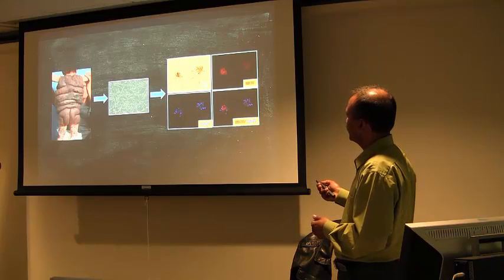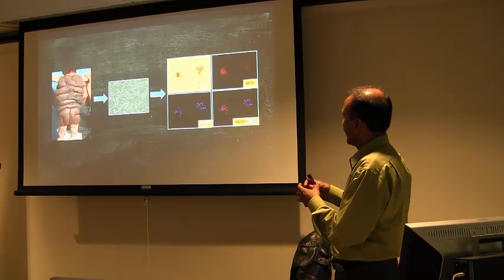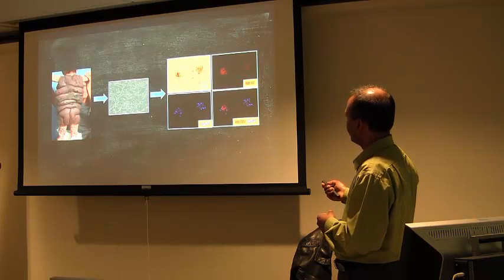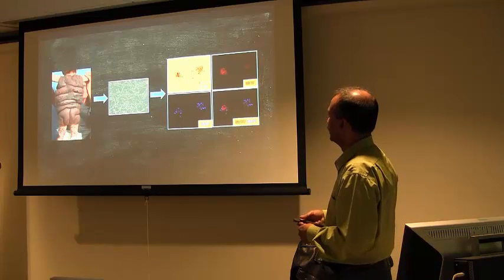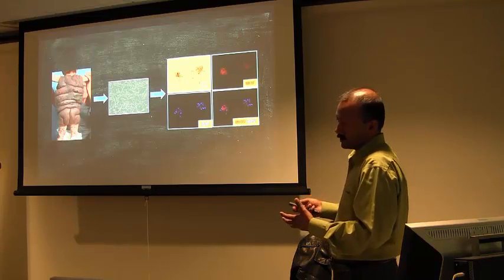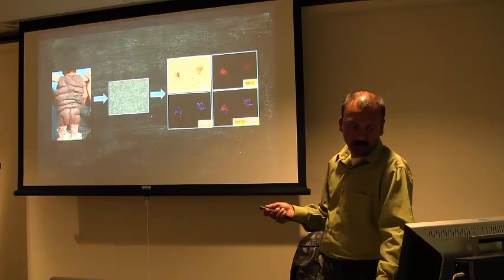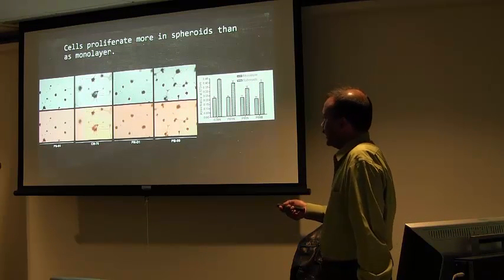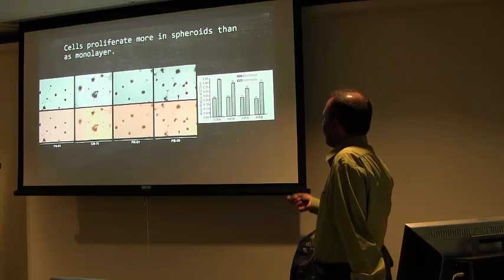We try to culture cells from these lesions and grow them as spheroids. And here you see a bright field picture of cells trying to form a spheroid. These are not compact either, but they are trying to form a spheroid. And they express the melanocytic markers here. So that validated that these cells are really coming from the lesion, not from any other source. And the way we culture them also eliminates the possibility of growing other cells in the tumor, which I'll come to in a minute. I tried many other patient samples, and they all were capable of growing as tumor spheres. We named them Vivo Spheres.